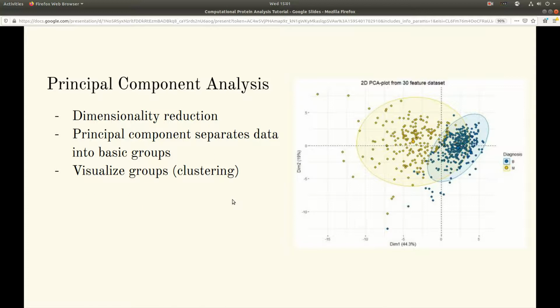So you have two groups of proteins here, B and M, and you're going to use PCA to try to say, okay, in dimension 1 and dimension 2, you can separate the data based on these things. Then you can go back and try to figure out what exactly is dimension 2. Is that position 37, position 100, something like that? You can use your imagination to think what's going on here.